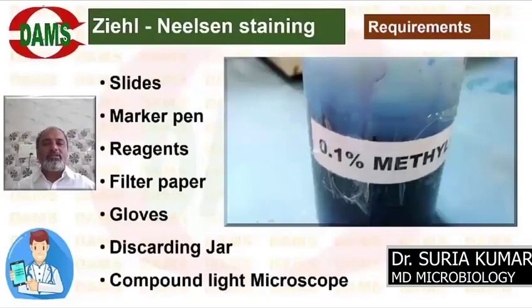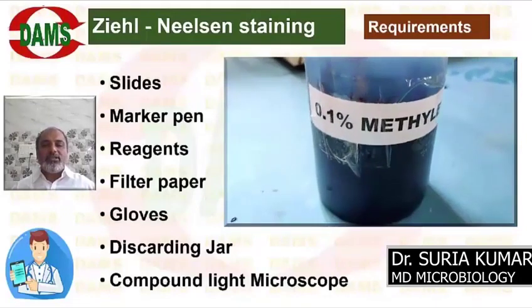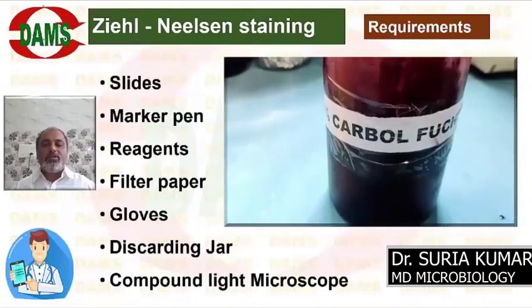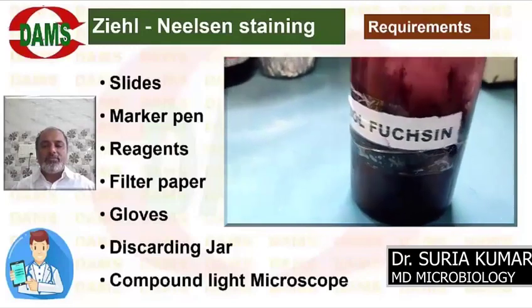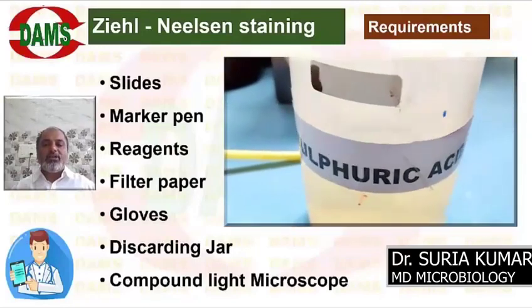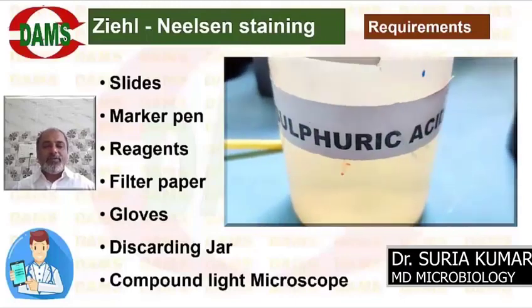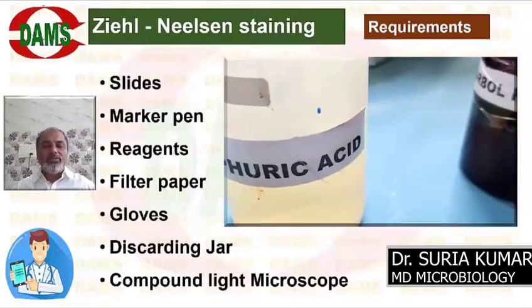For that we need the requirements: slides, marker pen, reagents, 0.1% methylene blue, carbol fuchsin, strong carbol fuchsin, and 25% sulfuric acid. Apart from that, we have filter paper, gloves, discarding jar which contains phenol as a disinfectant, and compound light microscope. We'll go to the procedure.